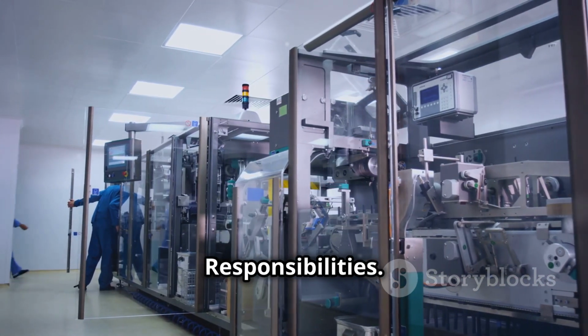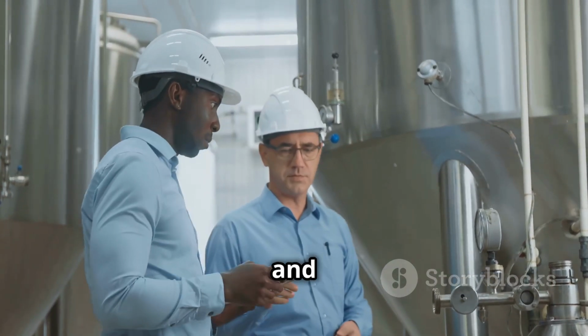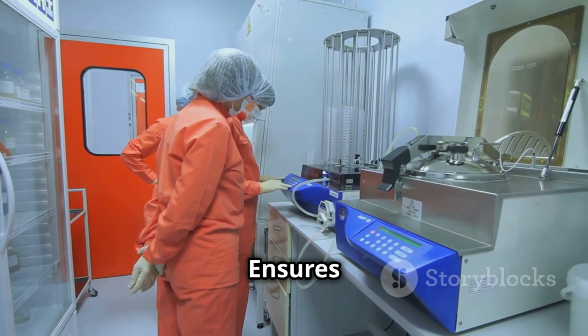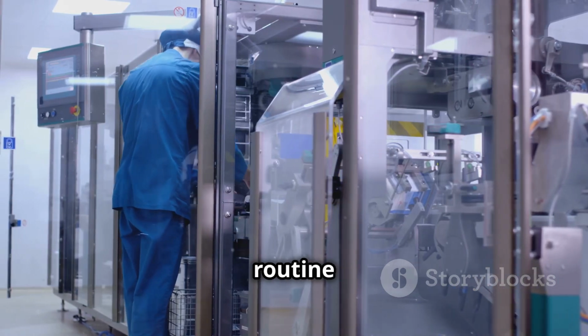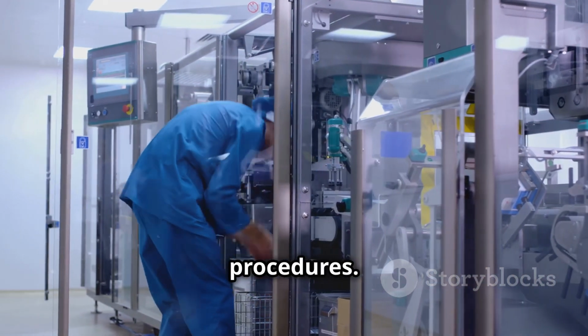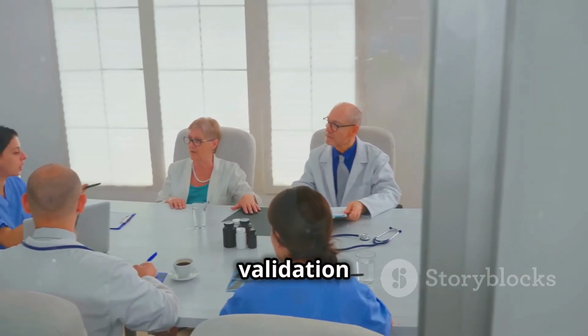Roles and responsibilities. Engineering department responsible for system design, installation and operational performance monitoring. Quality assurance ensures protocol compliance, data review and final approval. Operations and production ensures routine operation and maintenance as per validated procedures. Validation team, a cross-functional team overseeing the validation process.